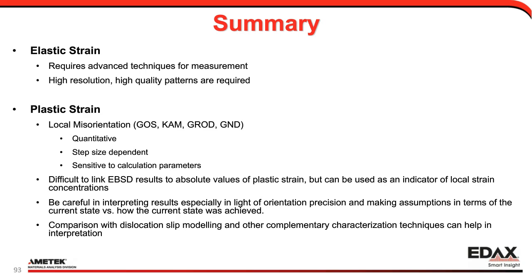Do be careful in interpreting the results, both in terms of orientation precision, and this goes to the quantitative part, the absolute strain part, as opposed to the flow fields and indicators of local strain buildup. But you also need to be careful not to always assume that what you're seeing in the microstructure is captured well, but how the material got there is not always well understood, not always captured. That has to be interpolated and inferred, although the in situ measurements can help understand that.